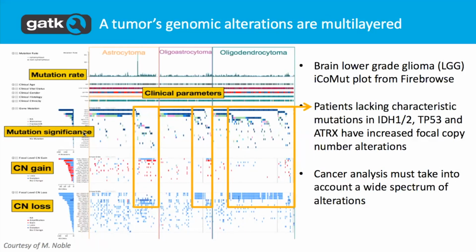And this is just a very detailed view of the different types of information that will come into the analysis of somatic variation, where you have multiple things that you have to take into account. They're typically more complex than in the germline context. But I'm not going to go into the detail of this.